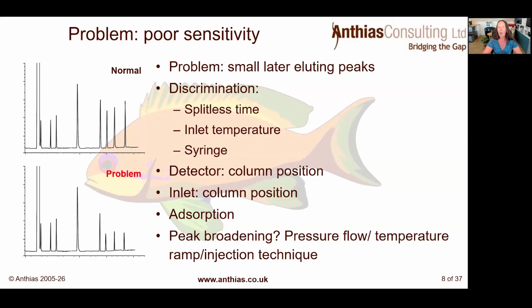So as I was talking about earlier, we want to gather all the symptoms before we jump to a conclusion about what it possibly could be. But hopefully this gives you an idea of how we're working through it. Yeah, so we're working step by step through the different modules, thinking about, could this cause the problems we are seeing? And again, then identifying the chemistry and the physical properties of the molecules which are affected.